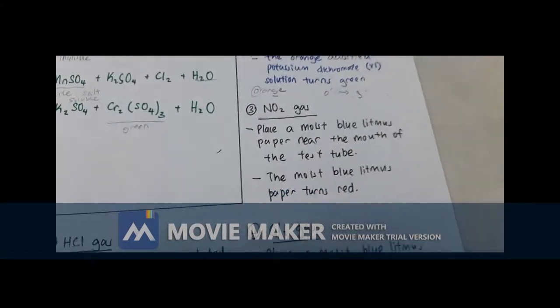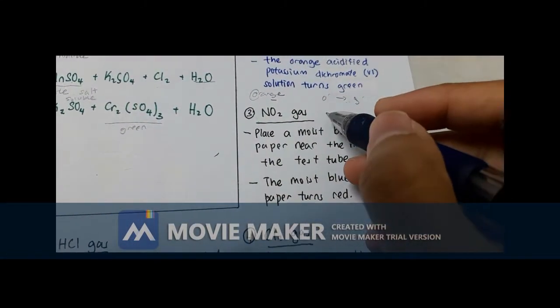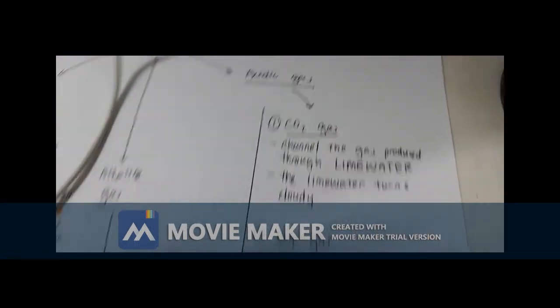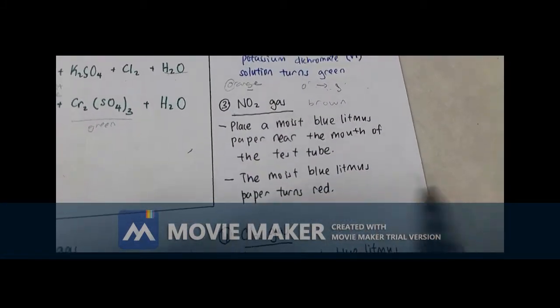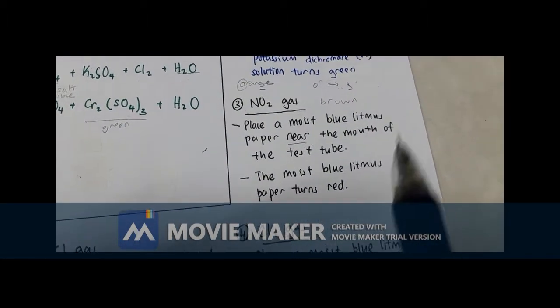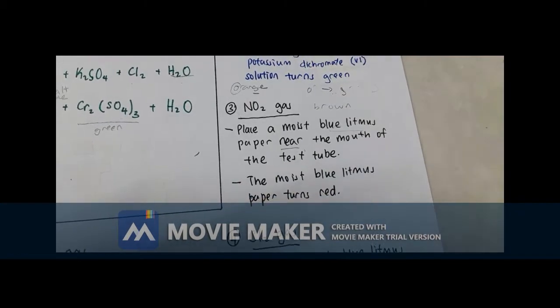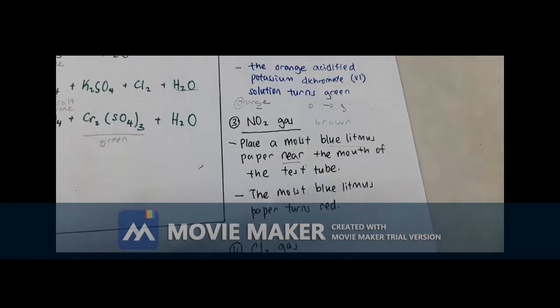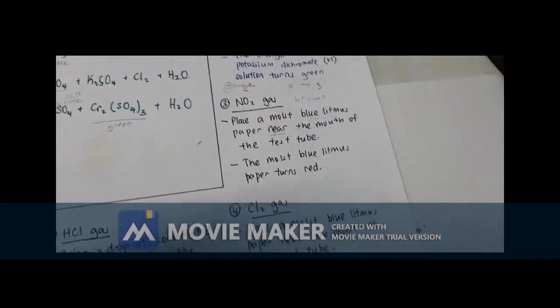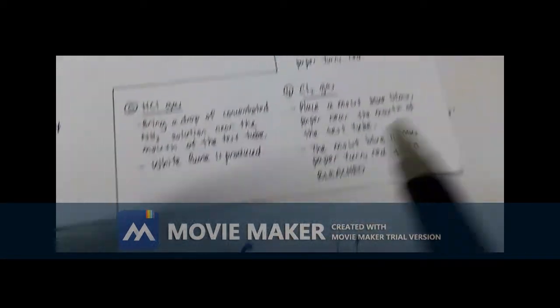Next we have NO2 gas, where the color of the gas is actually brown. Since this is an acidic gas, what you have to do is place a moist blue litmus paper near the mouth of the test tube. The reason why we're using blue litmus paper is because we're testing the presence of an acidic gas. By near the mouth of the test tube, I mean something like this.